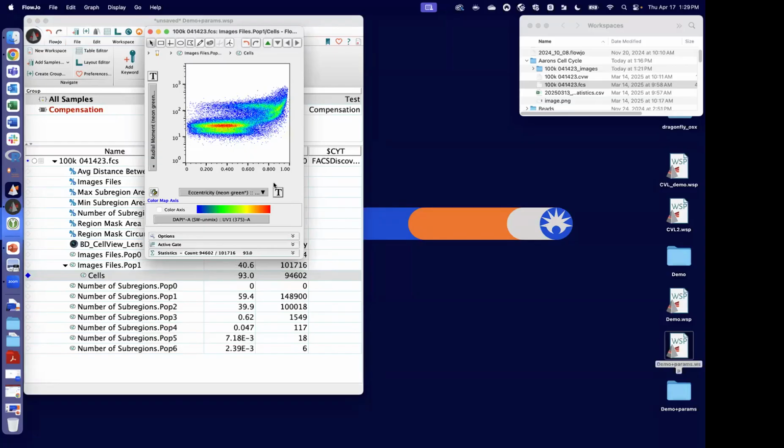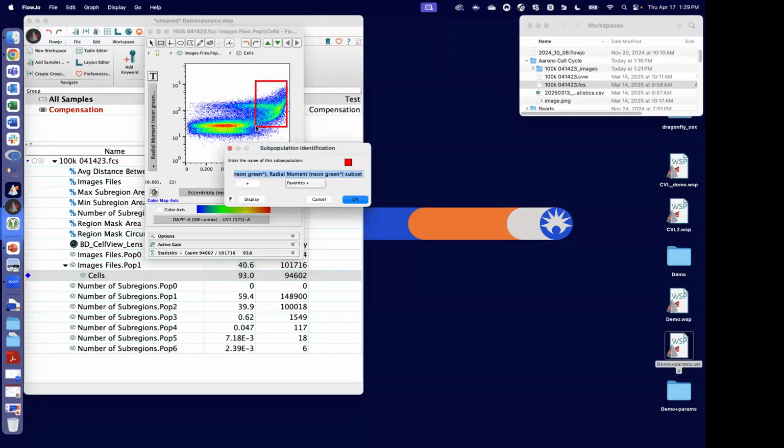So longish cells, in terms of their DNA, tended to be longish for the actual area taken up by the scatter as well, which is probably dominated by the DNA. So, sense. Okay, so we've got probably single cells and then probably double cells, or cells doing something more interesting. And since this is a cell cycle experiment, we could imagine we could gate the weirder ones and maybe hope to see a bunch of telophase and anaphase. So we'll say these are some overall kind of M phase.